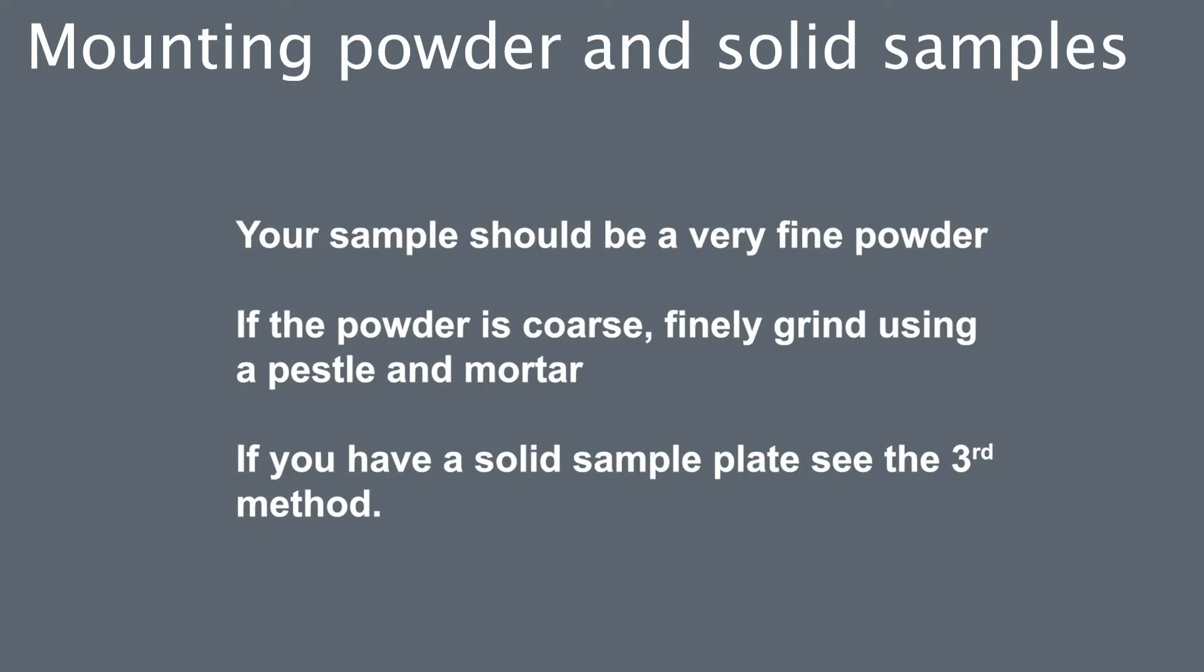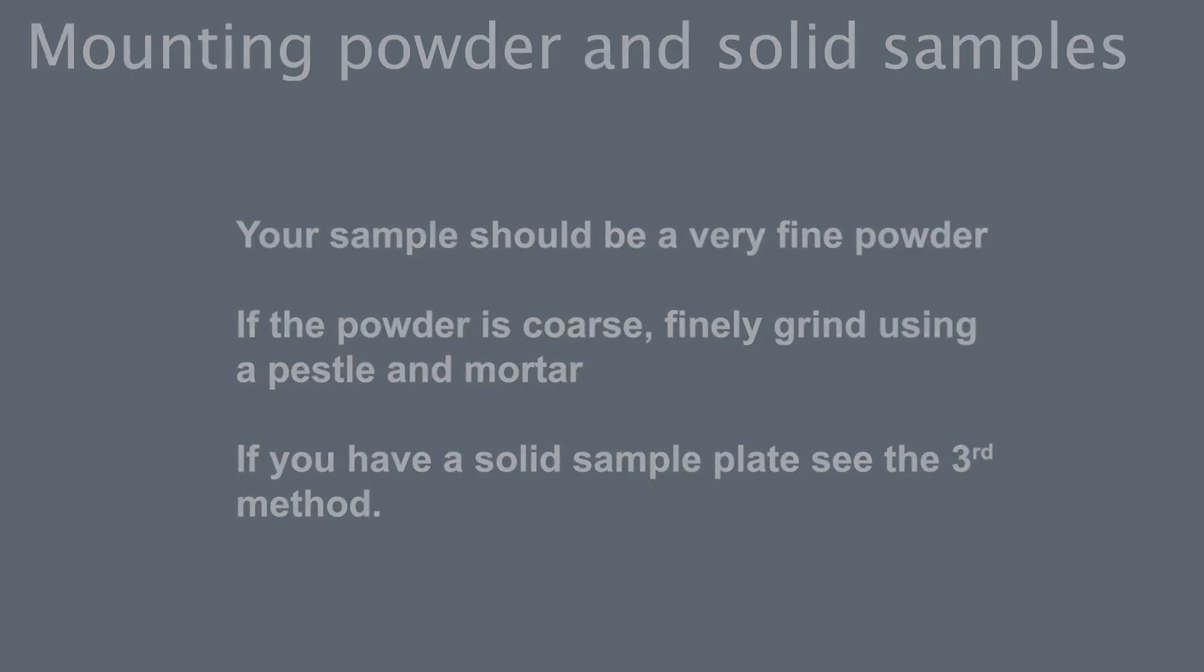Mounting powder samples. Your sample should be a very fine powder. If your powder is coarse, finely grind it using a pestle or mortar. If you have a solid sample plate, see the third method.